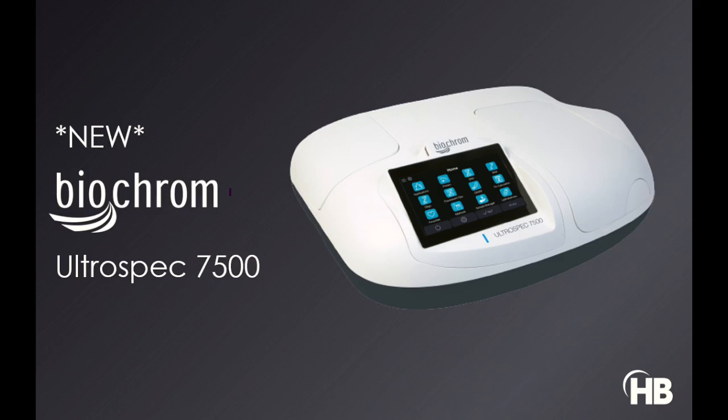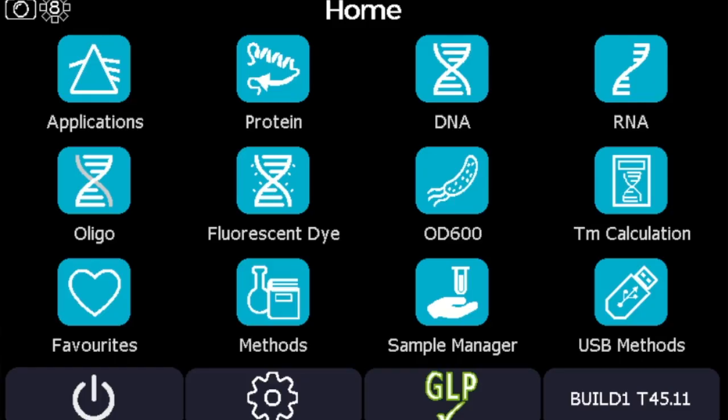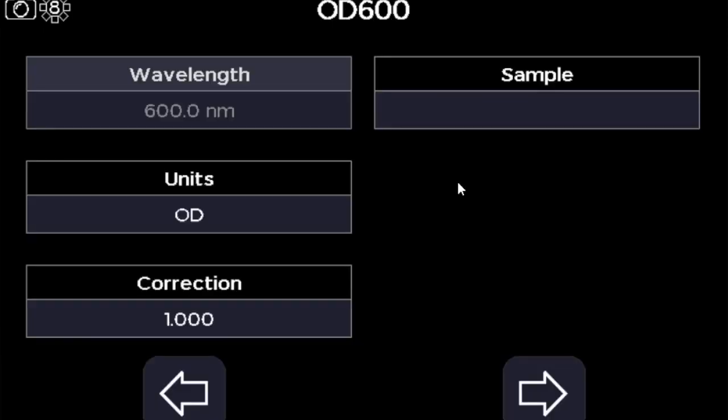When you switch on your Ultrospec 7500 you'll see a splash screen which gives you information about calibration each time you switch it on. You'll then get to the home screen which is icon-based, like an iPhone, with icons to show you different applications.